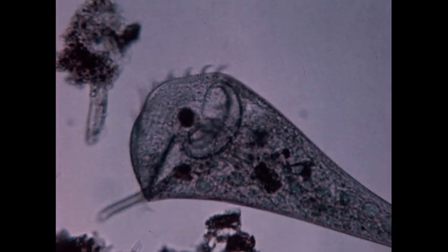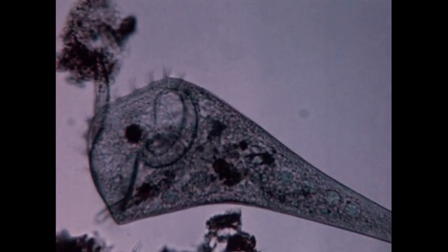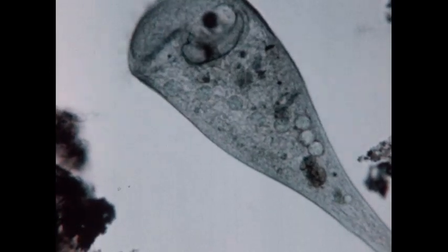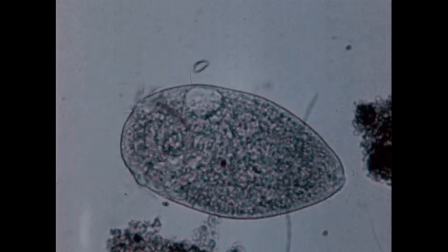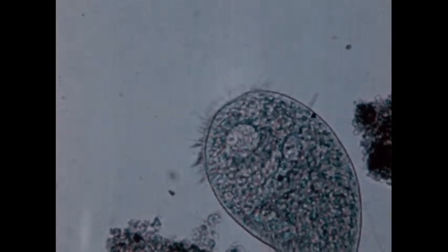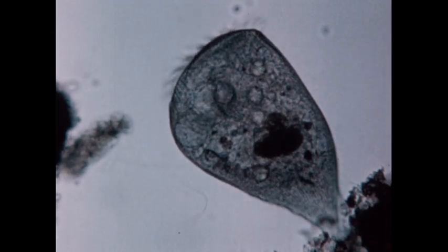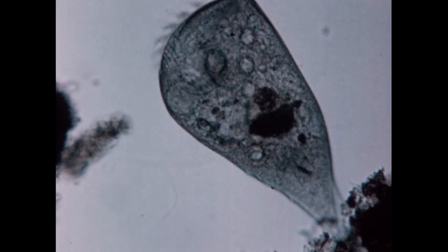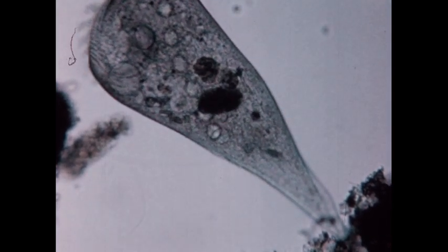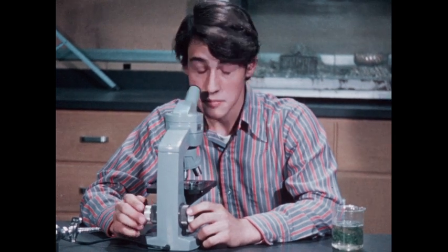A Stentor looks like a deep-sea monster as it streamlines its shape for swimming. Notice how the strong membranelles are used as propellers as it swims off. In its structure and adaptability, Stentor is one of the most complex single-celled animals. But single-celled plants and animals are not all the forms that we might find in our drop of pond water. Some are composed of many cells and are quite specialized.